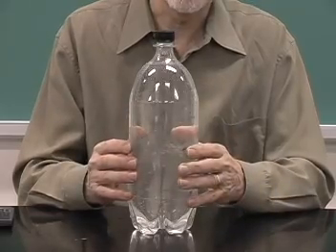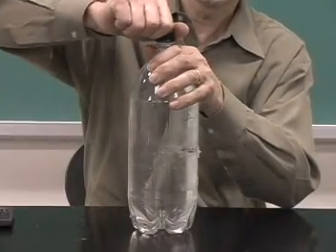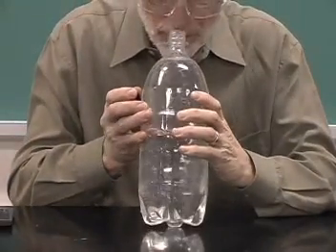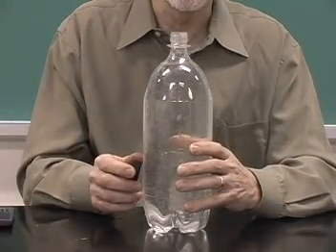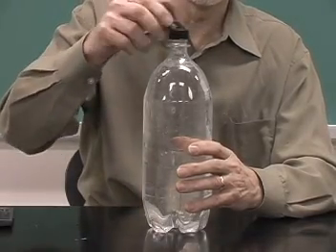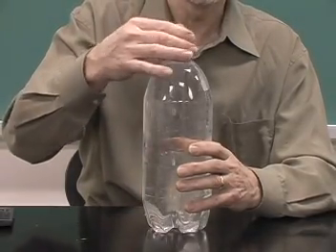Now that's quite a bit yet, but we can now open it up and take a whiff of it. And the smell of gasoline is still very strong at a concentration of 5 parts per million.